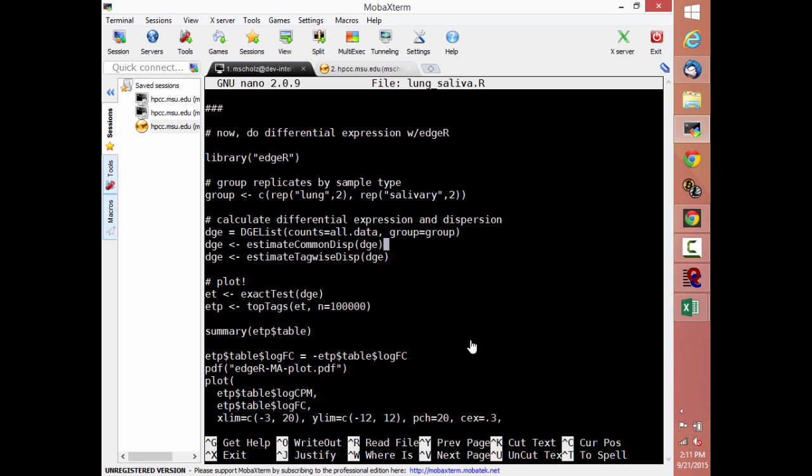It's awful. One of the few exceptions to all of that whining and complaining that I will do about it is the EdgeR user manual. It is 100 and something pages long, written in a way that you can actually scroll to the kind of analysis that you want to do and copy and paste the recipes, and it will work more or less out of the box, and then explain why it worked out of the box. It's shockingly useful and very, very nice. So if you're going to write new R code to do things, use the documentation in their manual. It has recipes, it has examples of different kinds of things.